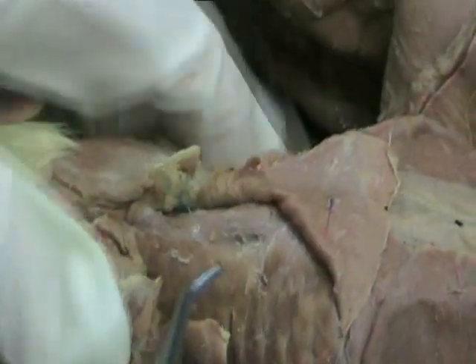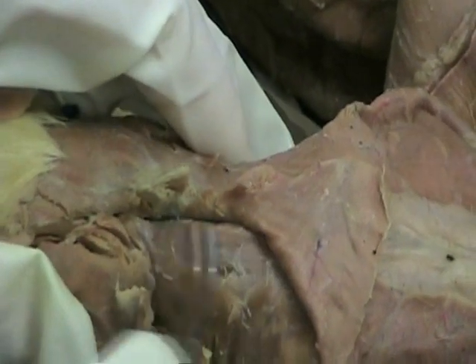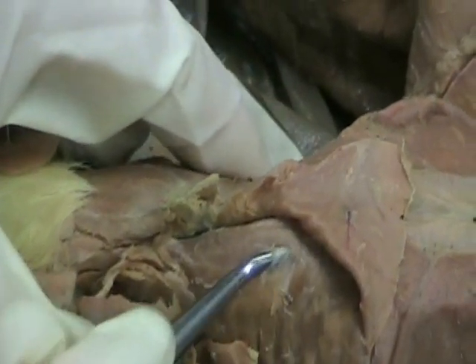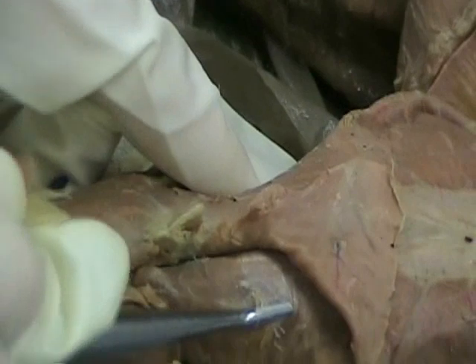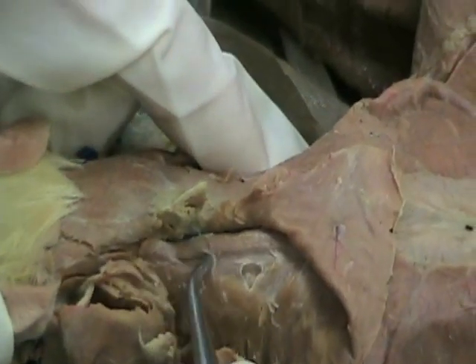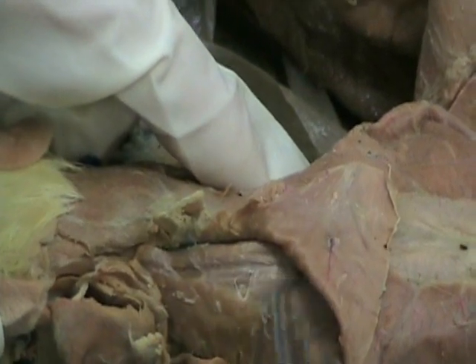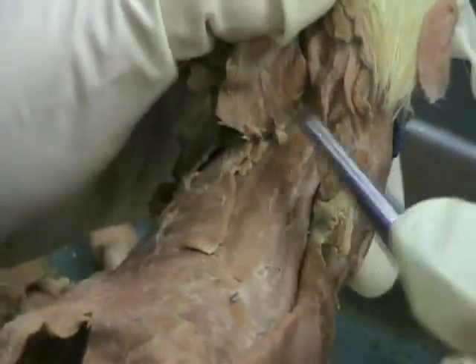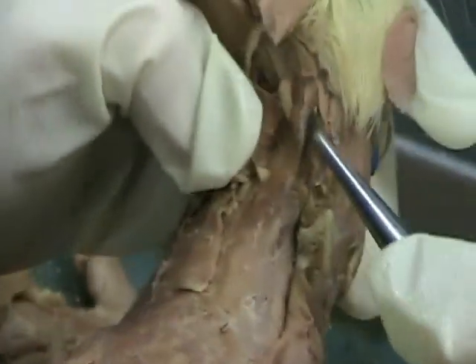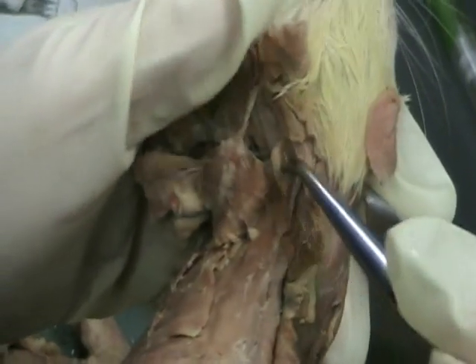Underneath this clear tissue, you can see a muscle going lengthwise. So underneath this tissue right here, the aponeurosis of this muscle, you see this muscle here, that's the erector spinae, okay? One of the epaxial muscles. The other epaxial muscle is totally obliterated, but it would have been this one right here, called the splenius. Okay?